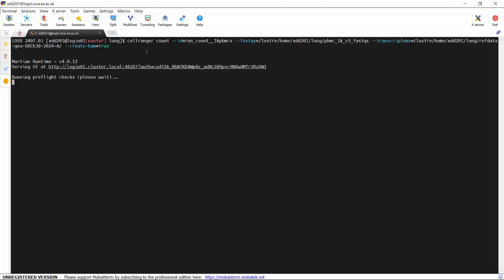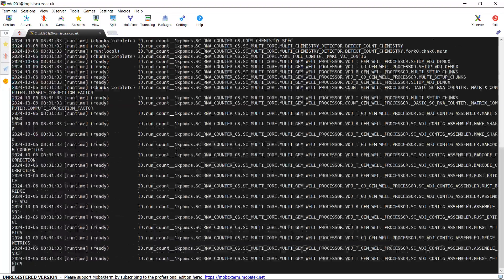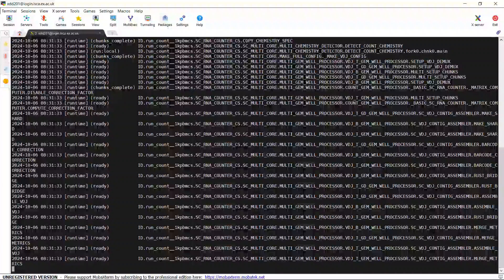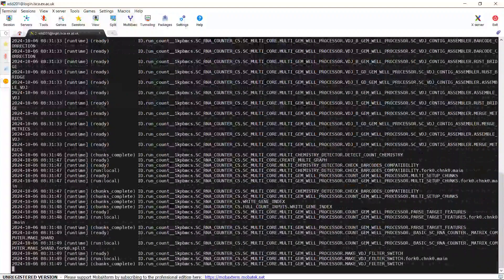Now we can run the code to perform the sequencing alignment. If we run, you can see the computer is running the Cell Ranger count function. I ran it before — it takes around 15 minutes for this dataset. We can wait until it is finished, then have a look at the files in the output folder.